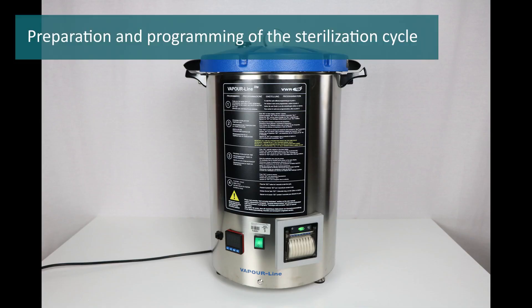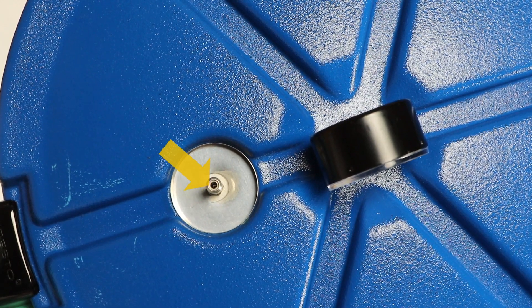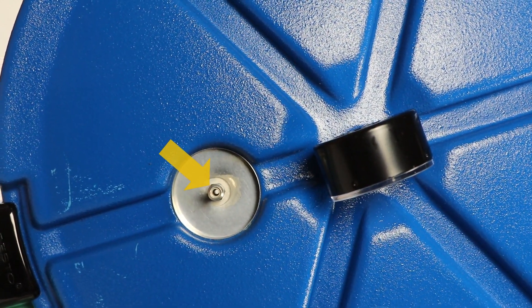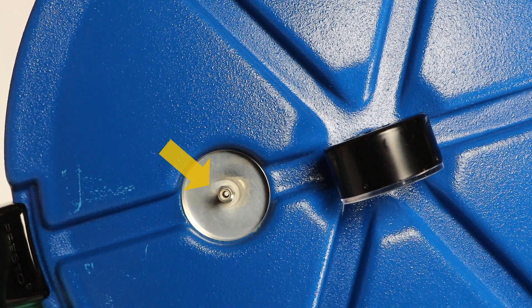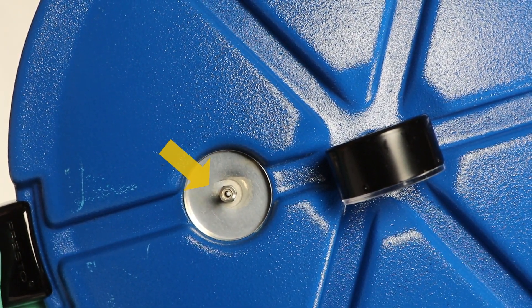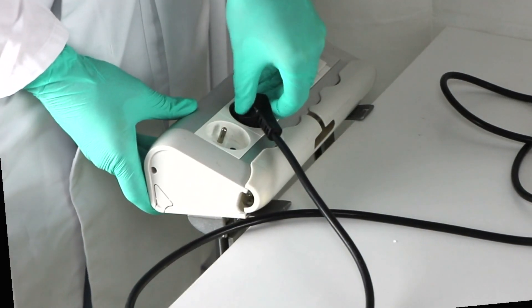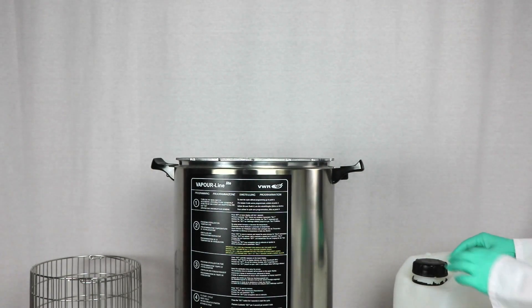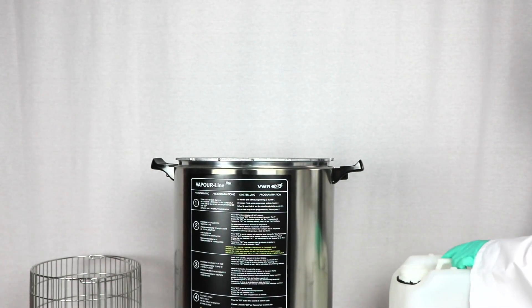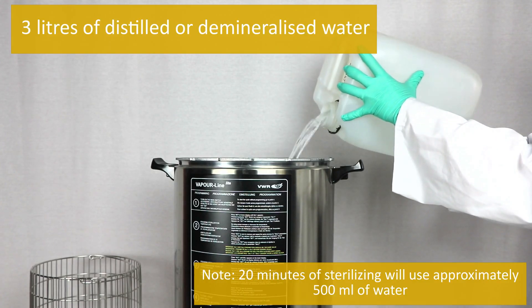Preparation and programming of the sterilization cycle. Ensure that the air vent pipe under the pressure regulator is open before use by holding the cover up to the light and looking through the air vent pipe. If blocked, excess pressure cannot be released through it. Connect the plug to the main supply.